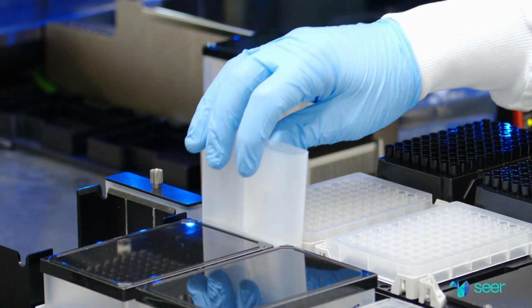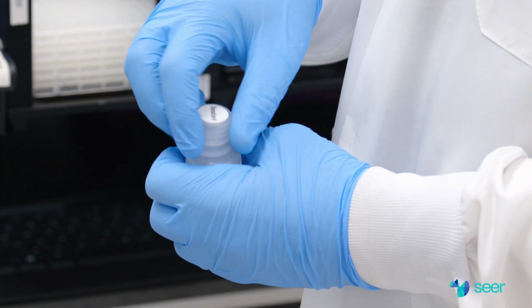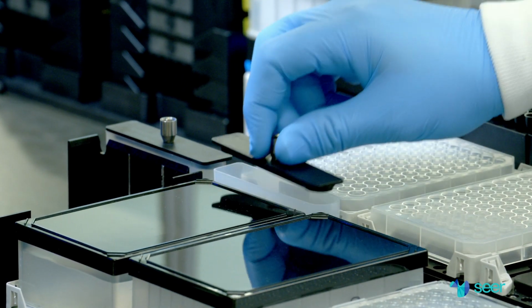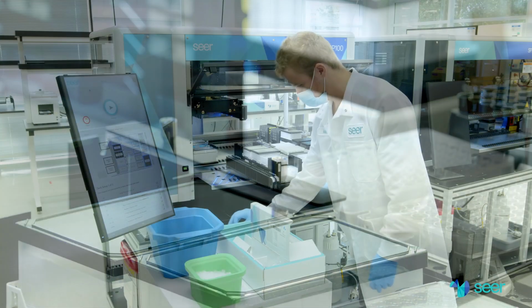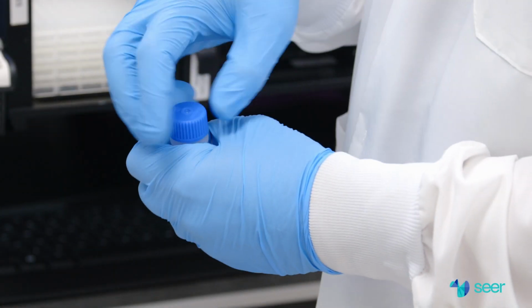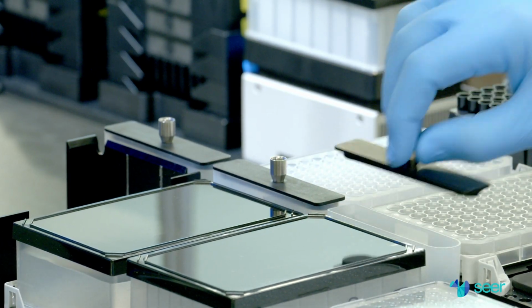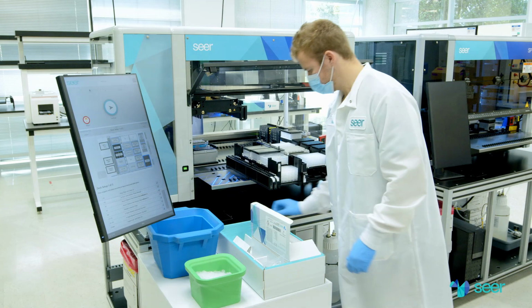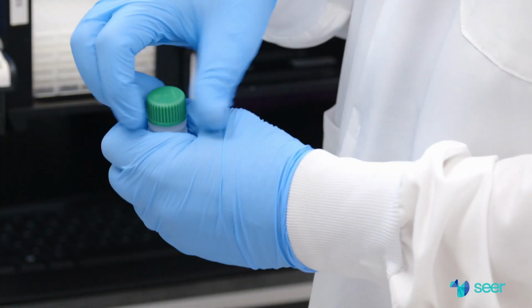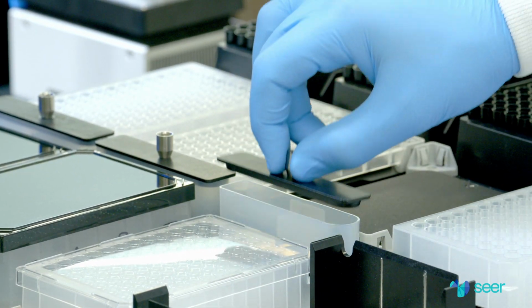Place the denaturing solution reservoir into position R2. Pour 1 bottle of denaturing solution into the reservoir and cover with a black core lid. Place the reduction solution reservoir into position R3. Pour 1 bottle of reduction solution into the reservoir and cover with a black core lid. Place the alkylation solution reservoir into position R4. Pour 1 bottle of alkylation solution into the reservoir and cover with a black core lid.